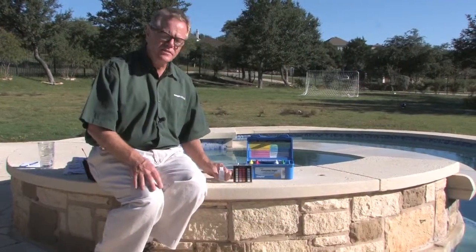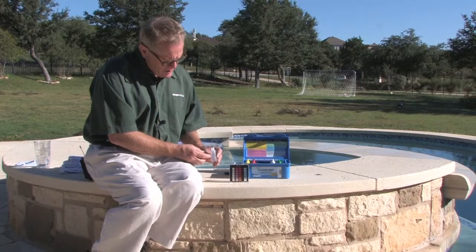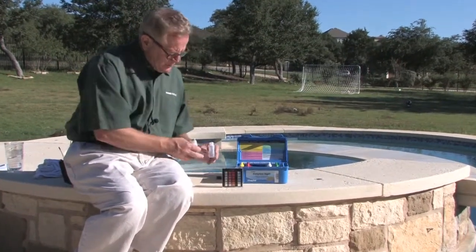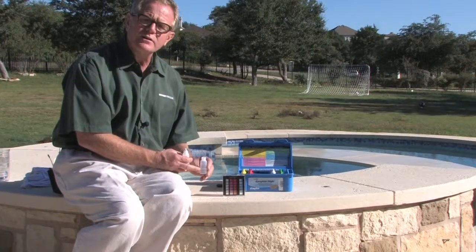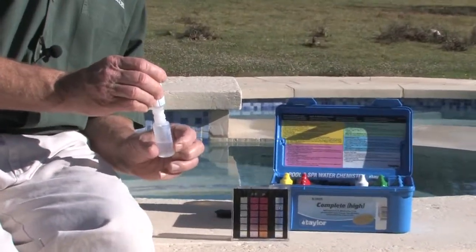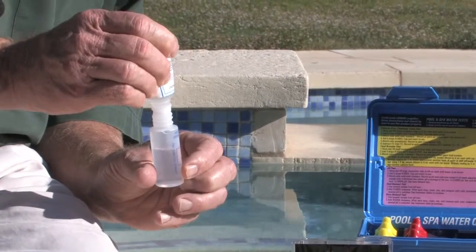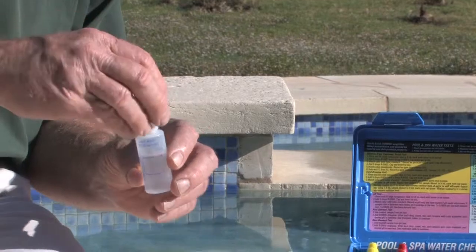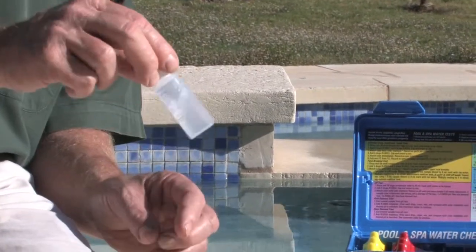In testing for cyanuric acid, you fill this small bottle to the 7 milliliter mark with pool water, and from 7 to the 14 milliliter mark with the cyanuric acid reagent. Then it takes about 30 seconds — you'll want to shake it a little bit and then wait.